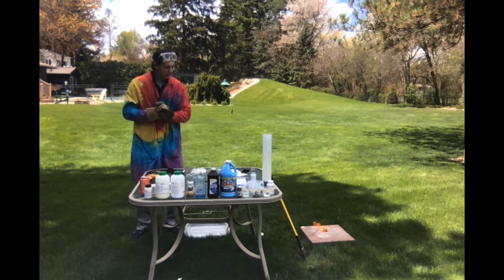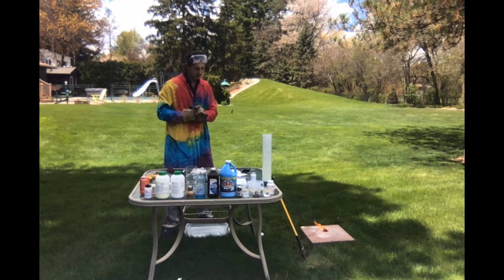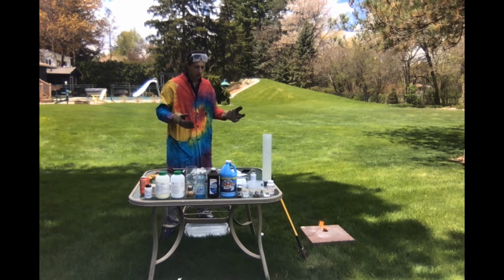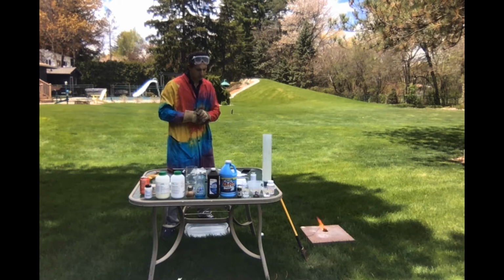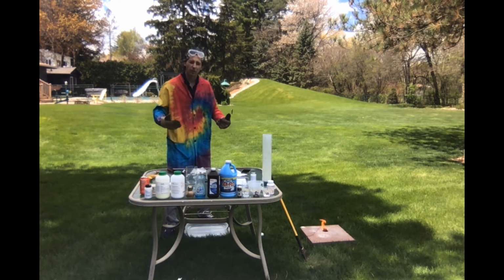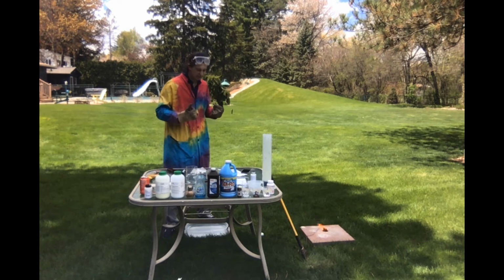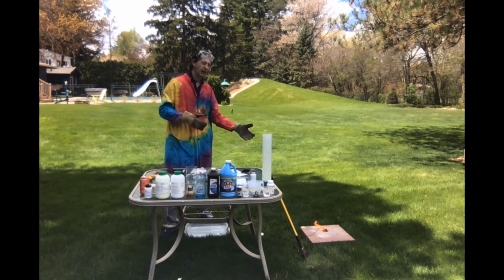So a couple of the observations that I'd make for number 2, burning of a cotton ball, is it is a white cotton ball with blue or purple on it from my first demonstration, turned into flames. I could definitely smell it. There is an exothermic reaction going on here because heat is being released, and the ball turned into black ashes with black smoke being released.